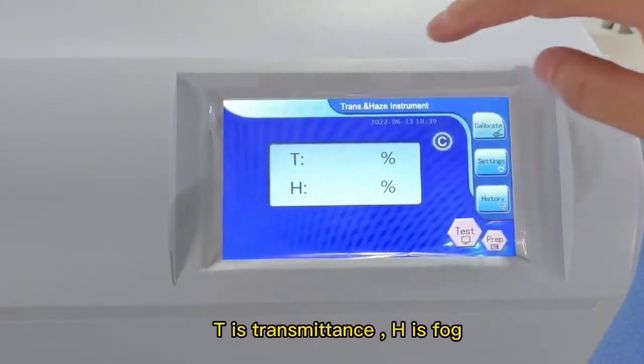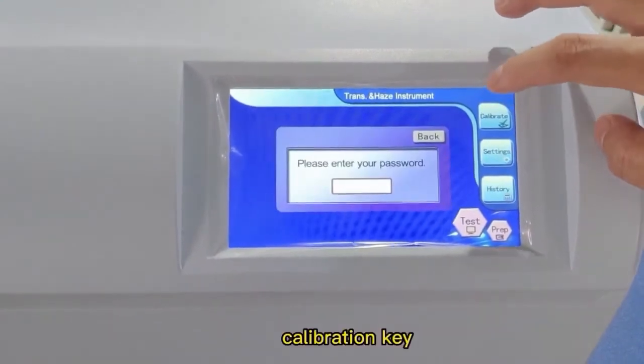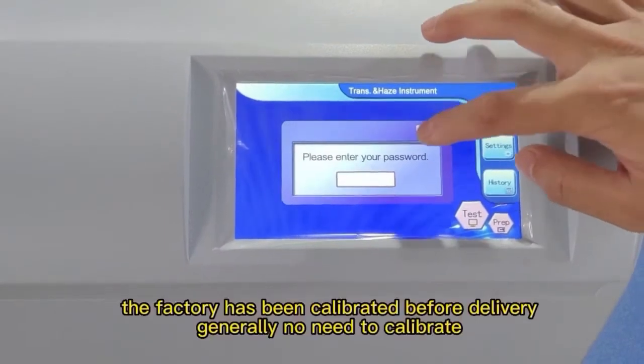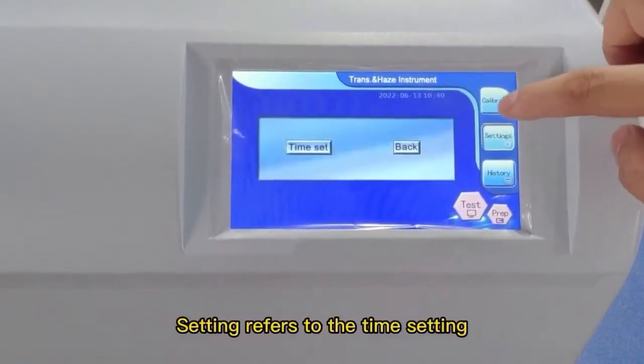T is transmittance; haze is fog. The calibration key is also shown here. The factory has already calibrated the instrument before delivery, so generally there is no need to recalibrate. The settings option refers to the time setting.